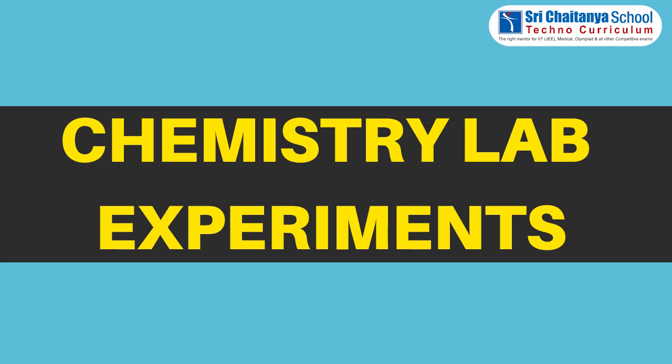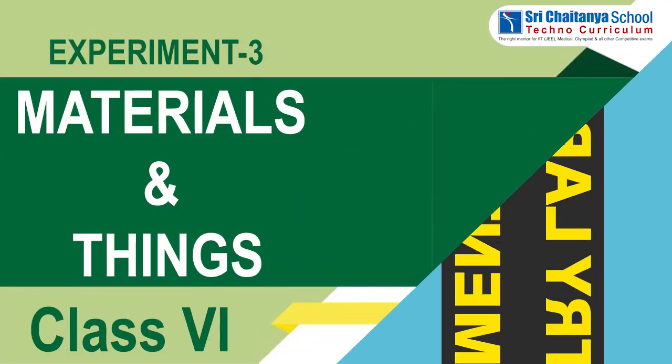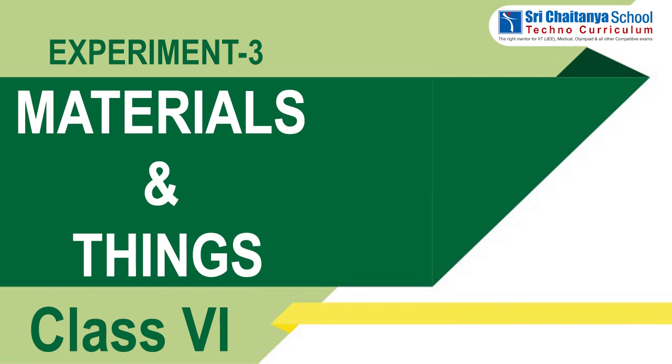Hi students, now we are going to do a chemistry lab experiment based on materials and things for class 6th standard.